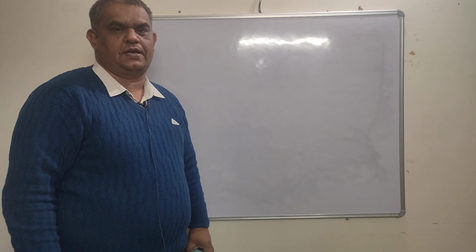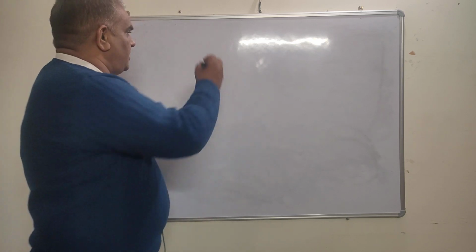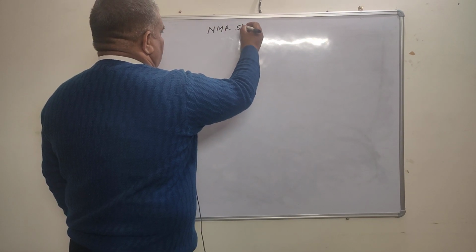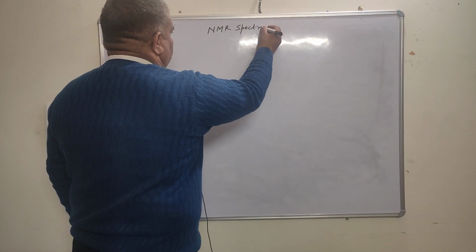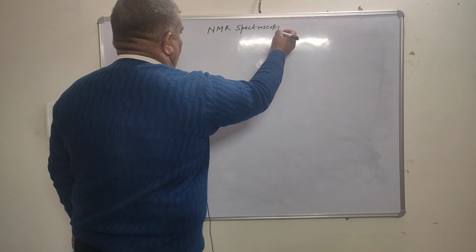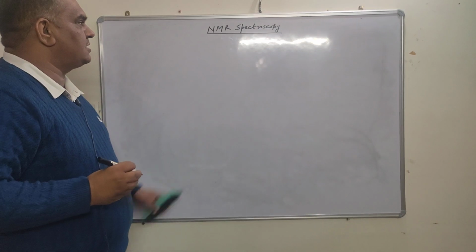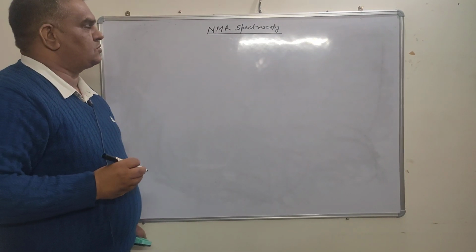Today's topic is NMR spectroscopy. NMR stands for nuclear magnetic resonance spectroscopy.